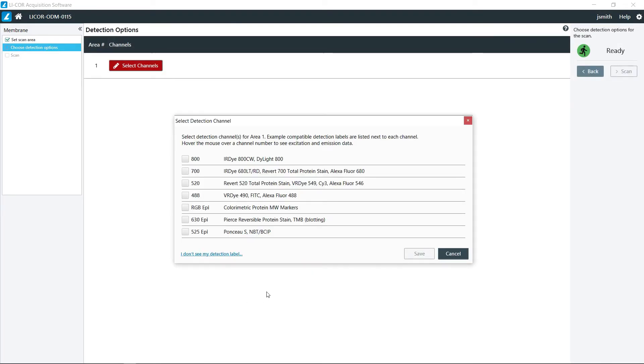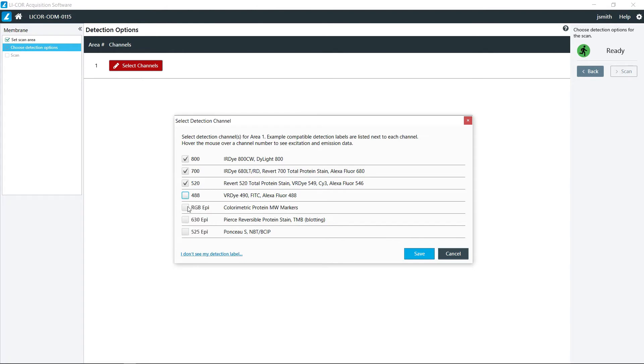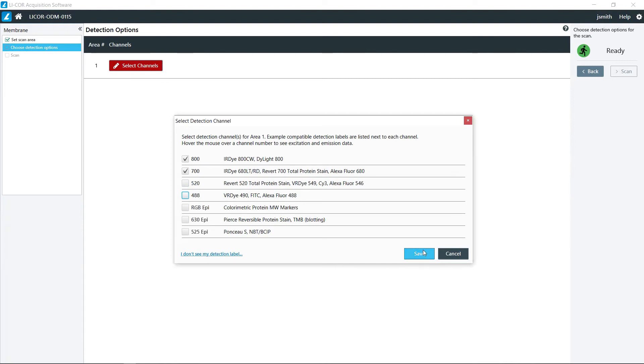Here's where you get your choices for all of your wavelengths. If you're doing a two color western using the 700 and 800, you just simply click on those. You can do different combinations and some of these do turn off the other ones based on the wavelengths. But we're just going to keep it simple for demonstration and show the 700 and 800 channels.